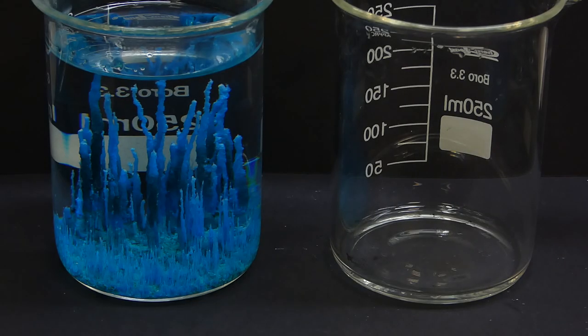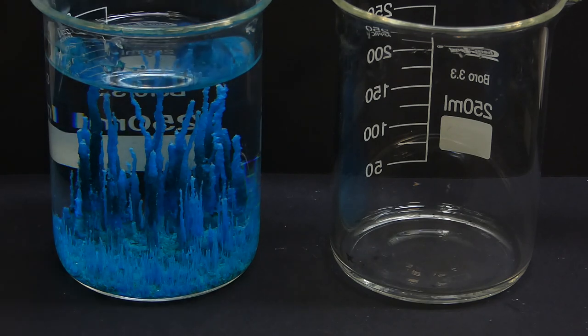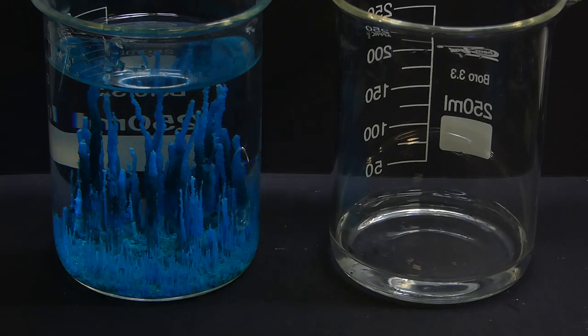After the structures stopped growing, you can carefully pour out the water using a syringe, because spraying the water normally would ruin them, and when you are done you can dry them and use as a nice decoration.